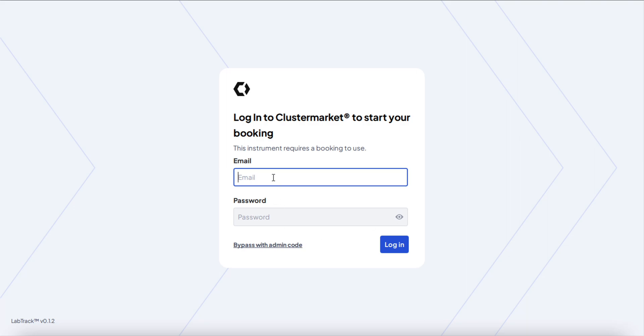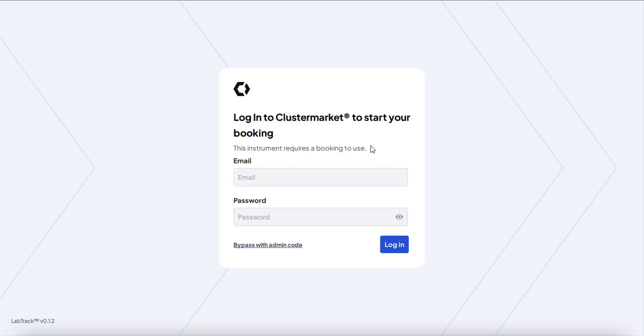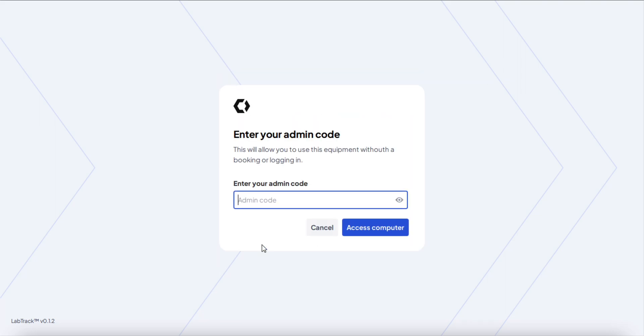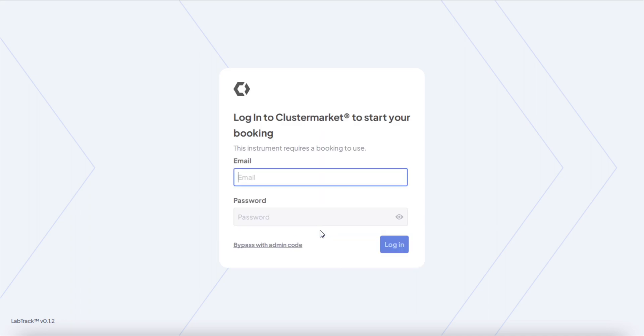This is how a user would interact with the app: same email and password they have on Clustermarket. In this case, the instrument requires a booking to use, as you can see, because I've said so in the settings. If you want to bypass it with the admin code, this is the link where you click. Enter your code and then you can access the computer without having to log in. If it's a regular user, they would have to log in with an email and password.